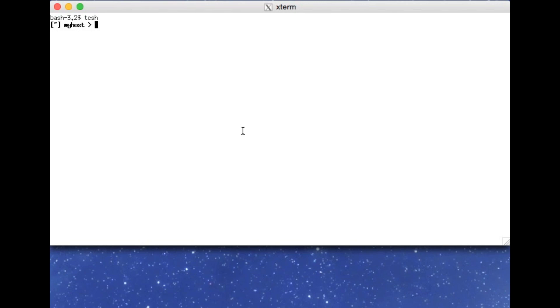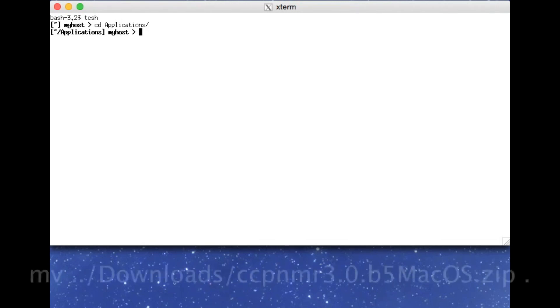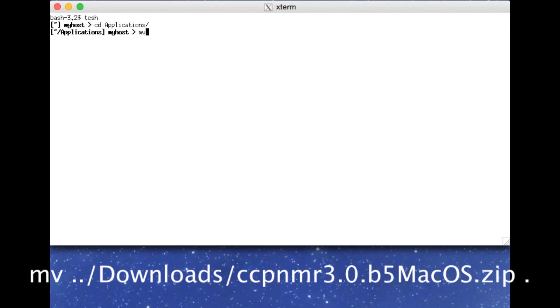You can install the program very easily from the command line. I'm going to start by going to the folder where I want to install the program. Then I'm just going to move my downloaded file from the downloads folder to the current directory.